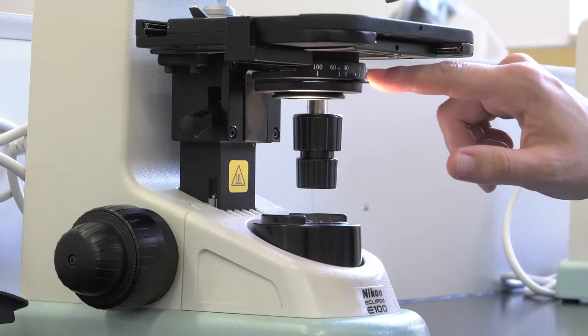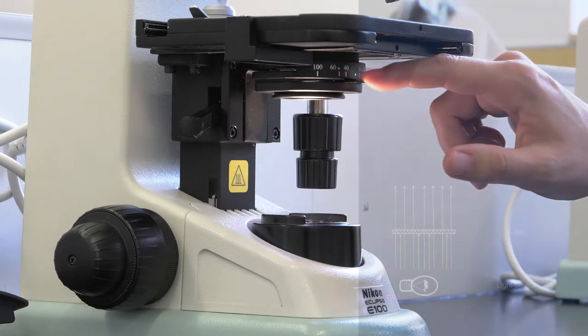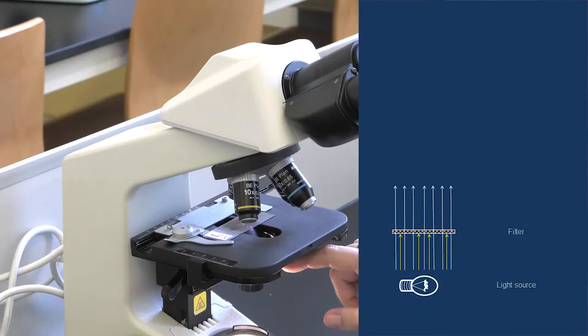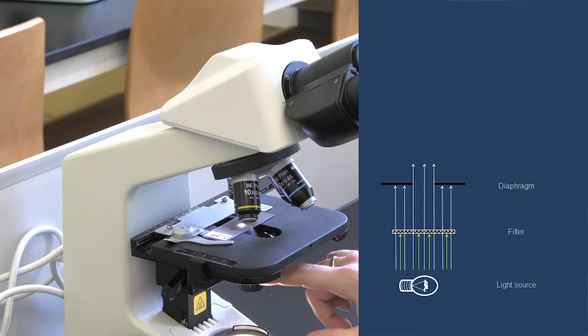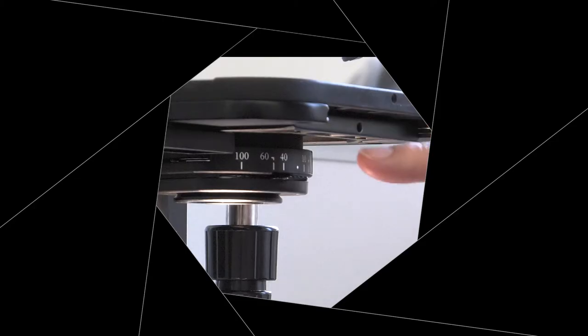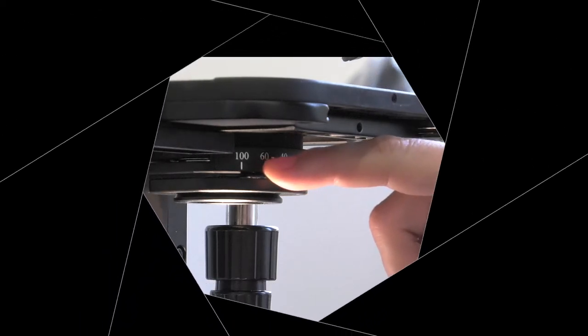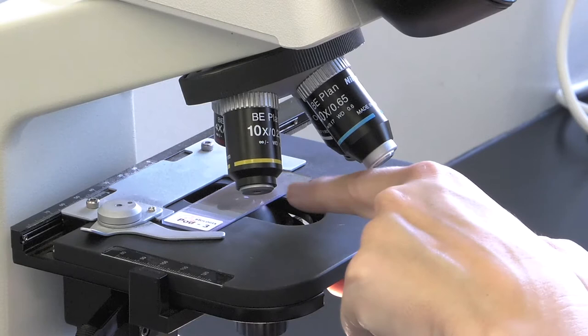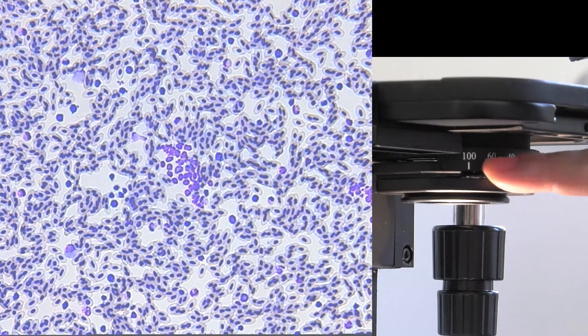Just before the condenser lens, we find the diaphragm lever. The diaphragm, or iris, is the instrument that regulates the amount of light that impinges on the sample. It is formed by a series of overlapping flat plastic plates. Thanks to a lever, the diaphragm opens and closes in a circular way allowing the control of the light input.